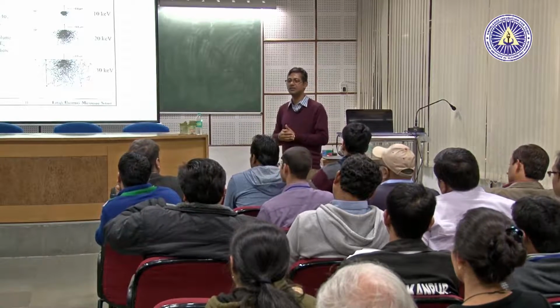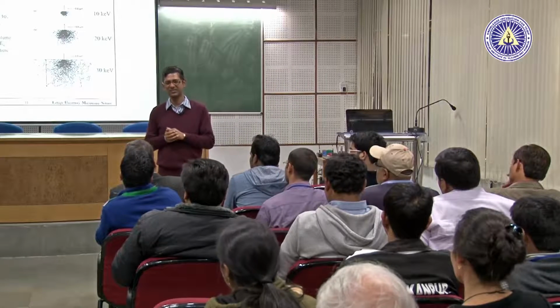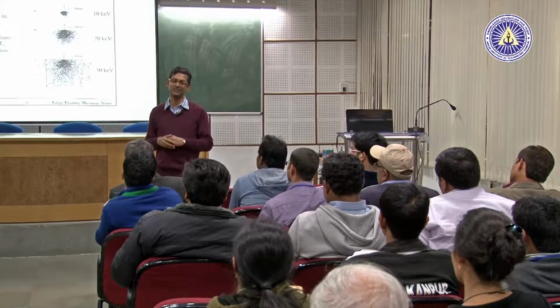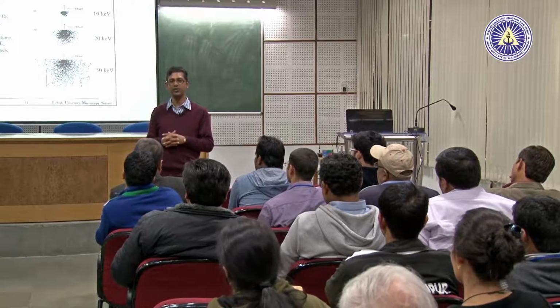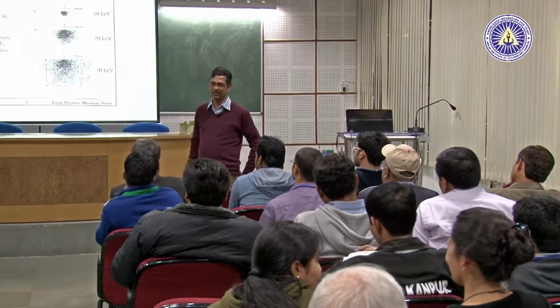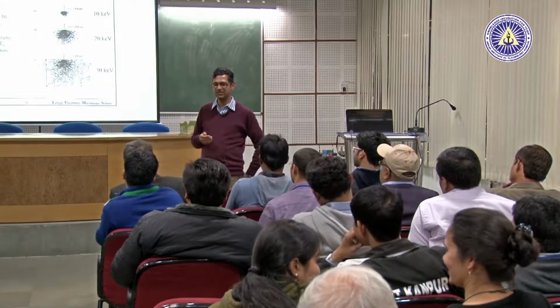The magnification you told is around 5 lakhs. 5 lakhs you can go on any machine. So is it optical magnification or digital magnification? No, optical magnification. Digital magnification can be very high. Nowadays even good SEMs' magnification can go up to 10 lakh times. It's possible. But routinely you can go 2 lakhs very easily. Magnify. And why can we not see the atom?